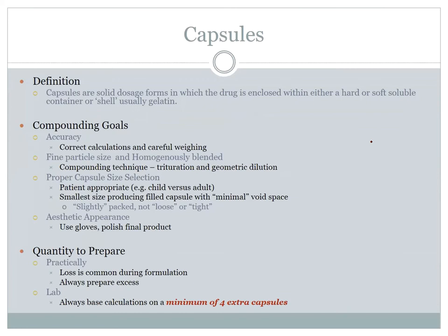All right, let's move on to some capsules, man. So what did we do last week on the exam? Powders. What are you doing today? Powders, but in a capsule. So realize there's some similarity.